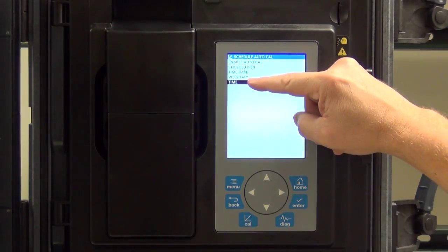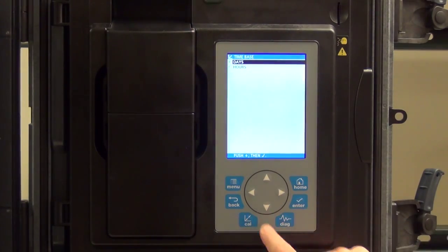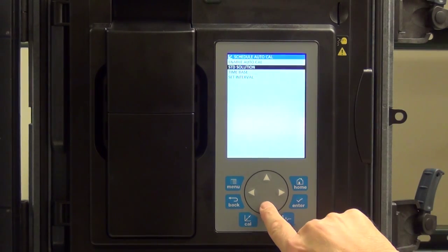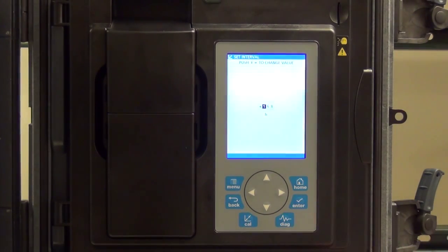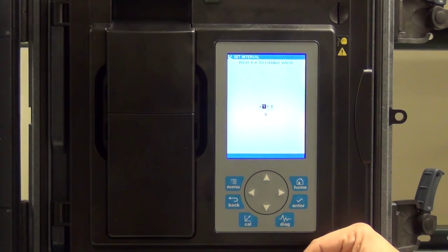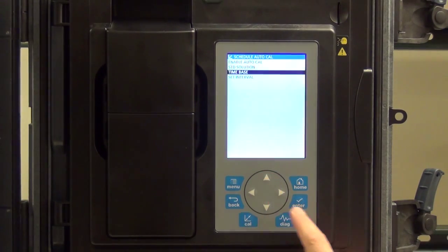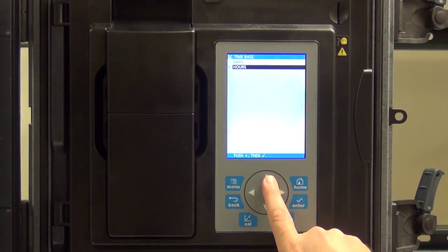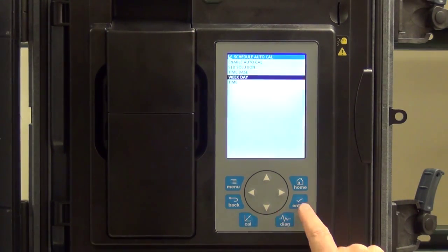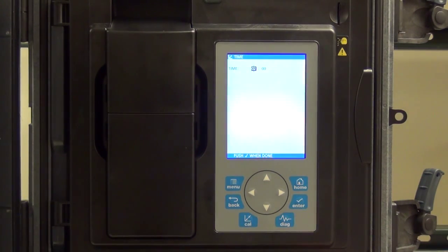But notice if we want to switch to a different time base, we can select hours instead. And when we do that, the days of the week goes away and we're enabled to choose the interval. Notice the default value is 168 hours, which is once every 7 days. But we'll switch it back to the default time base. We'll do it by days of the week. And so now it's set up to, again, calibrate only on Sundays at 2 o'clock in the morning.